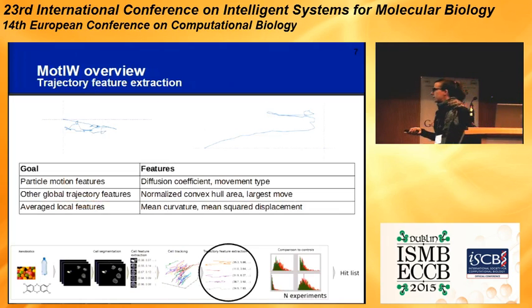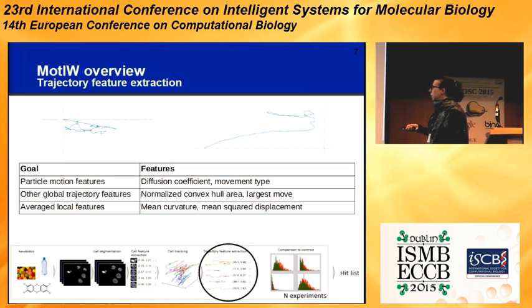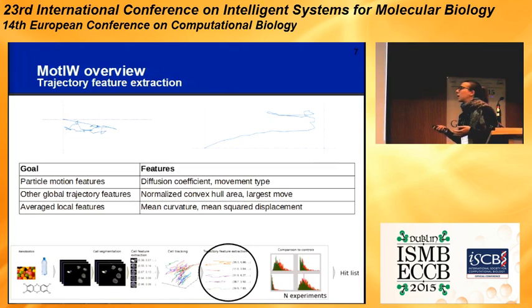So following this, we are here, and we have for each experiment a set of trajectory features. We are going to want to describe them too, and for this we have found in the literature and partly designed ourselves a set of 15 trajectory features.